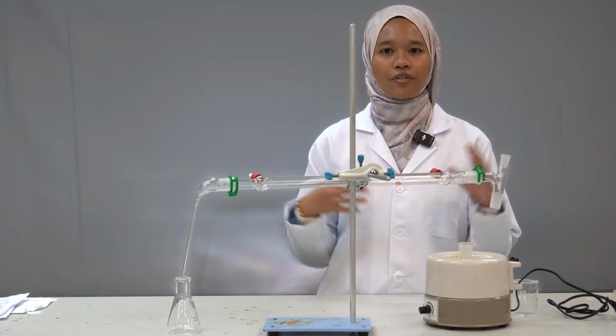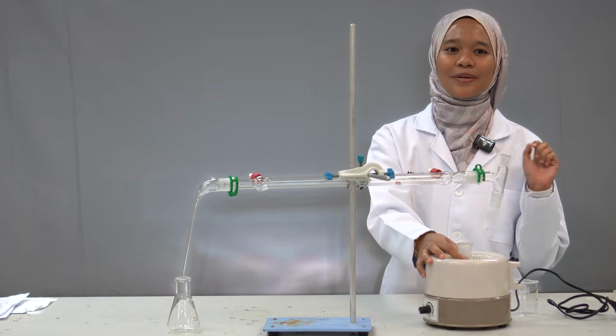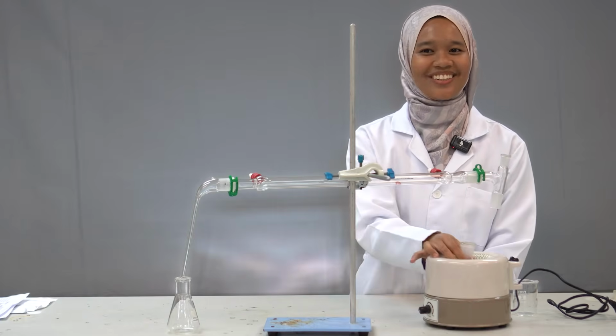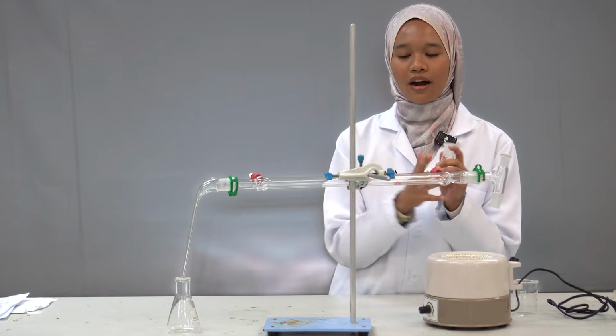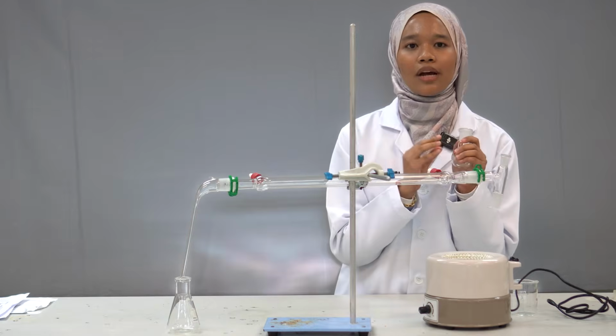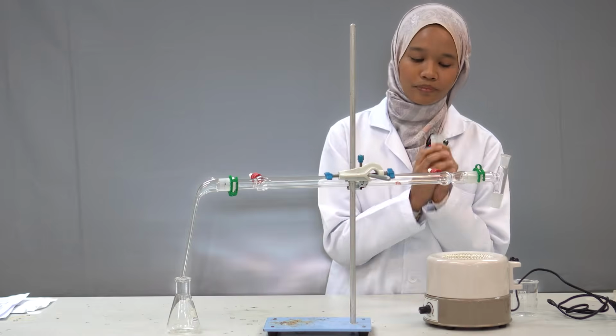Do you remember what mixture we used to separate by using this method? The mixture that we separate by using the distillation method is DCM, dichloromethane, and also a basic solution.